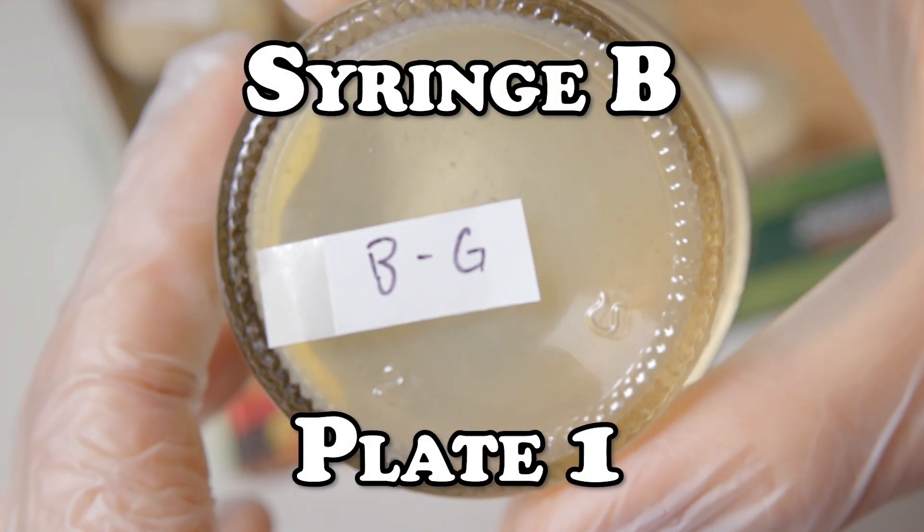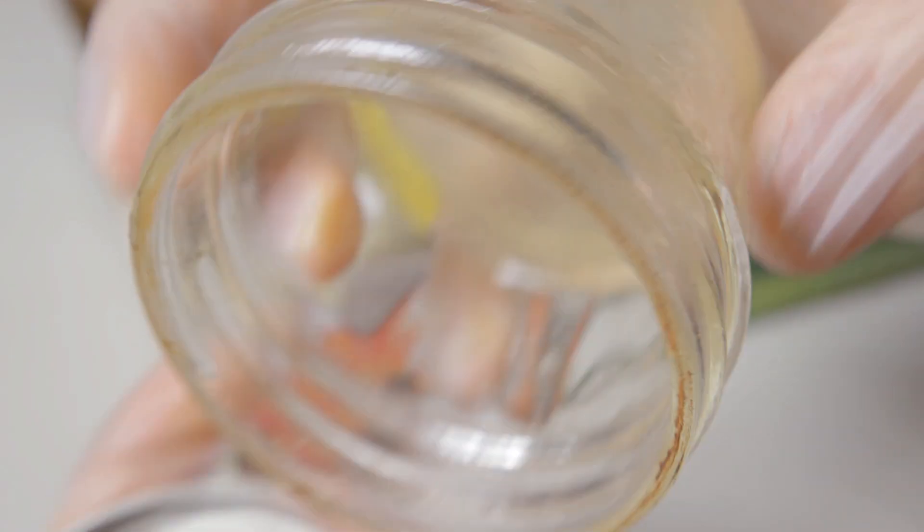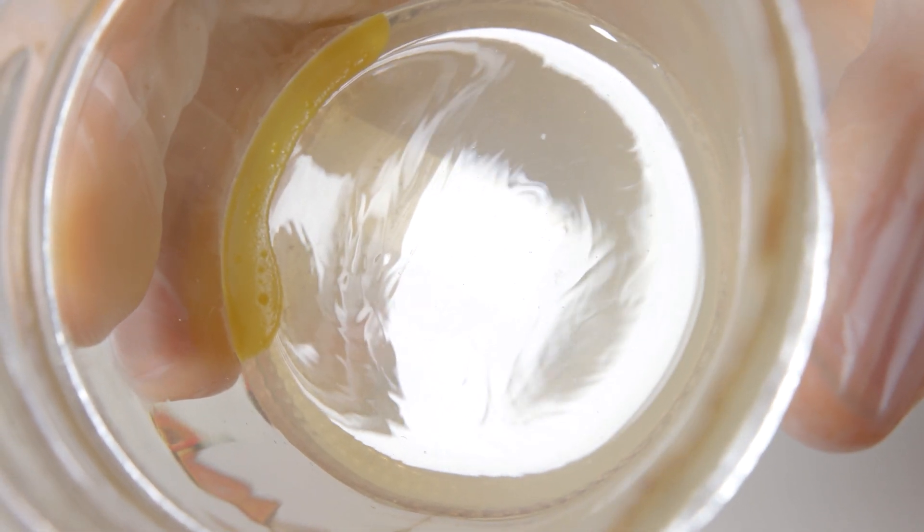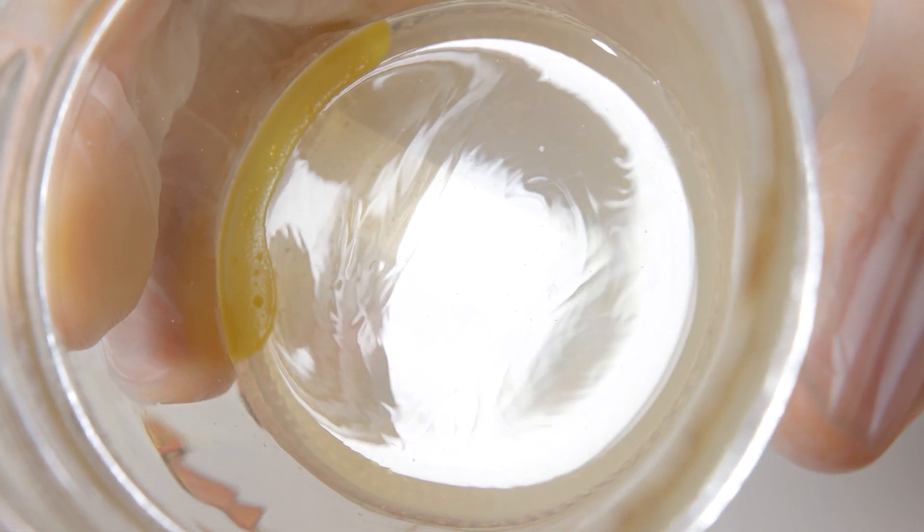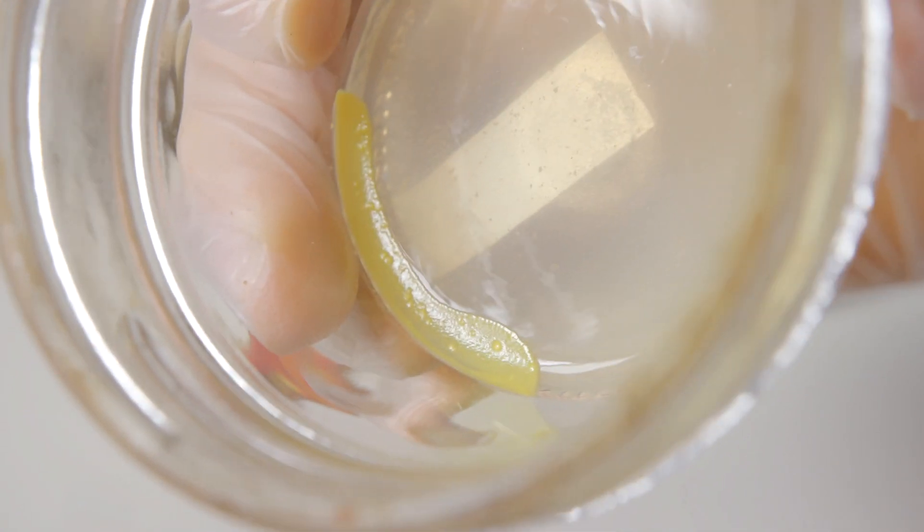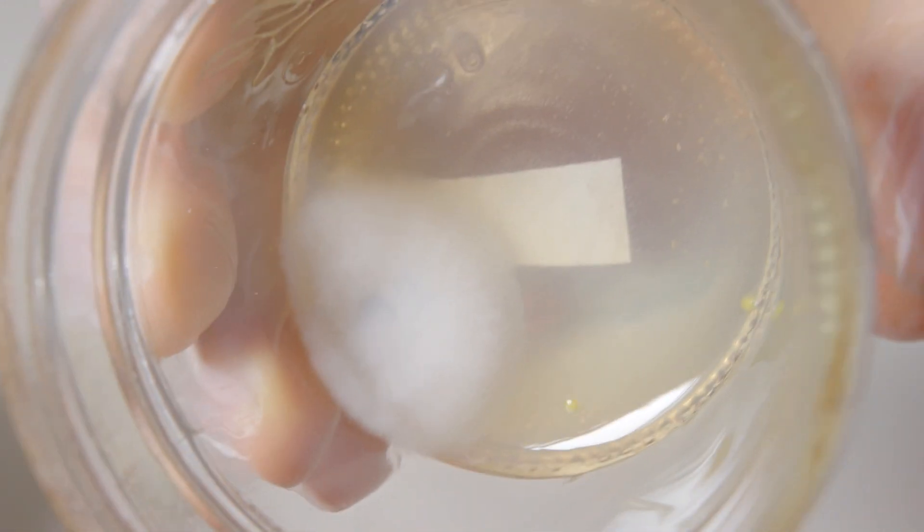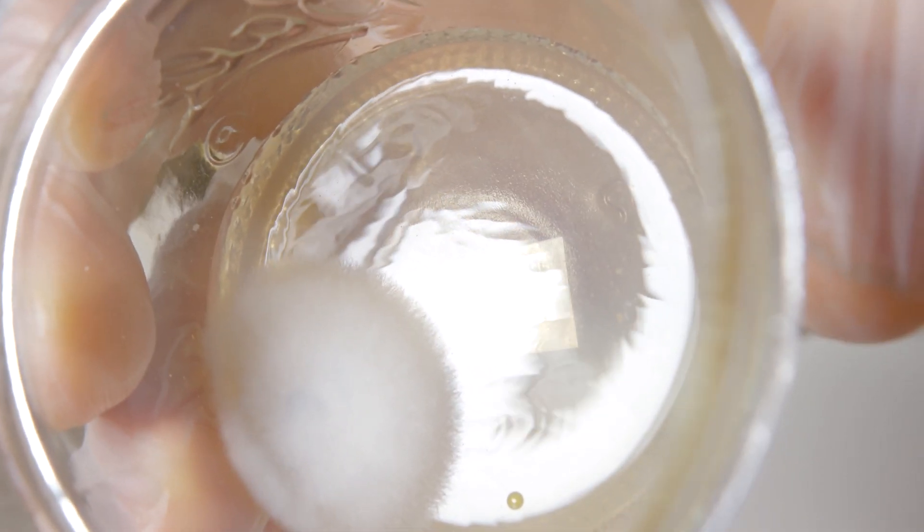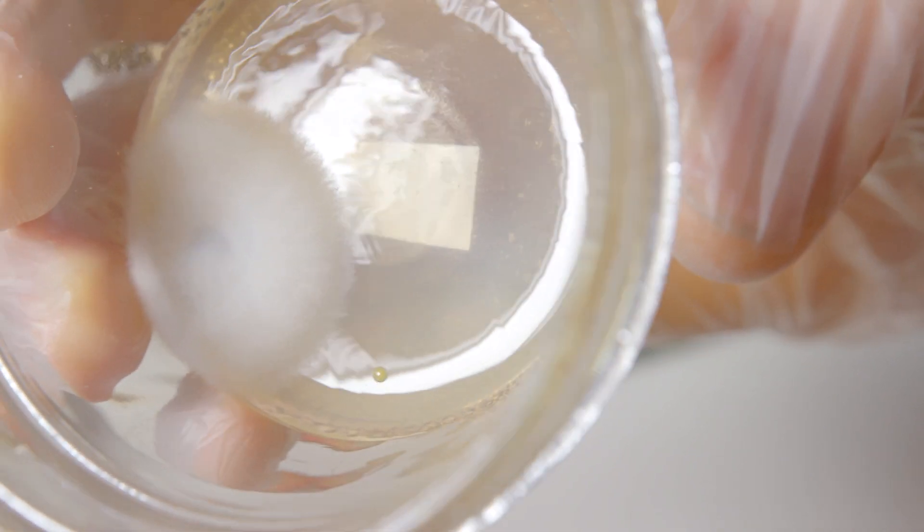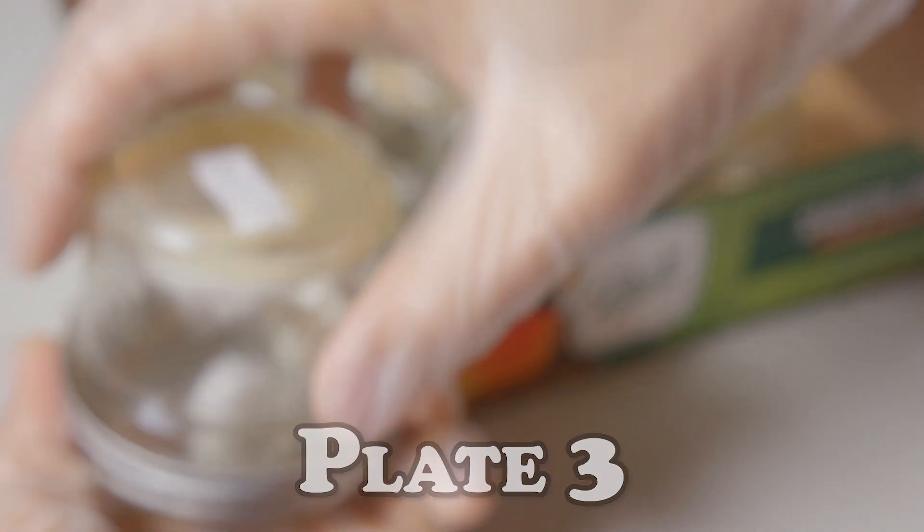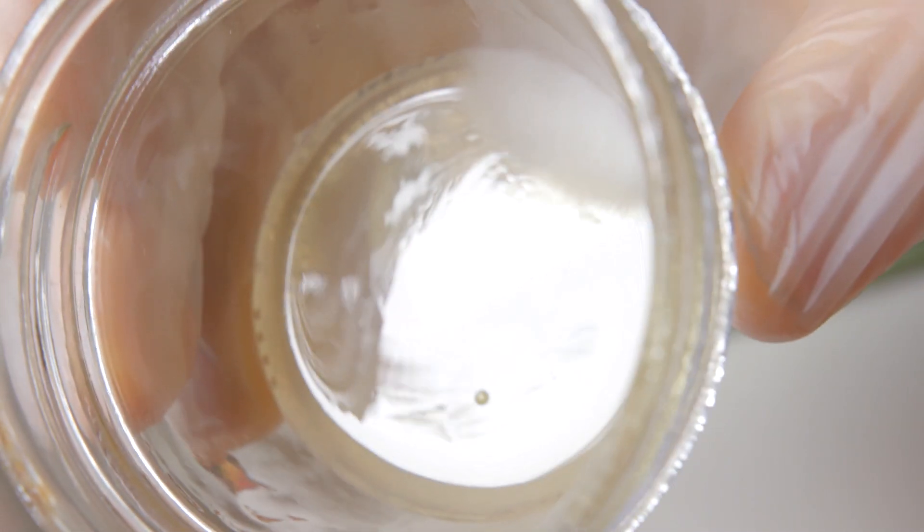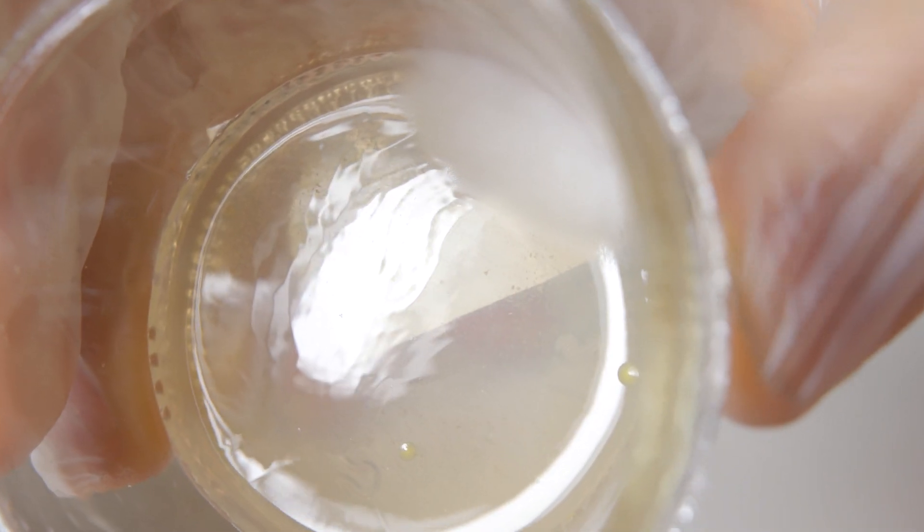Let's move on to the first plate of syringe B, keeping in mind that we got absolutely no mycelium on regular plates with this syringe. Now here's something interesting - while there is still no indication of mycelium, we can clearly see a streak of inhibited bacteria along the edge of the plate. If no antibiotics were present, this streak would have quickly multiplied and devoured the entire plate as it had in the regular dishes we saw. Moving on to the second plate of the set, and it looks like we got good news. We've managed to get viable mycelium from this filthy syringe. While we do see a couple of stalled colonies of bacteria on the plate, they're going nowhere, and we can easily transfer this mycelium to a regular plate. We do this because, just as with people, antibiotics are best when used as needed rather than as a preventative measure. Let's take a peek at our third plate. It looks like we have more mycelium. A few inhibited colonies of bacteria are present, but we can easily transfer this to a fresh plate and start the isolation process.